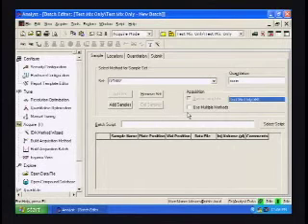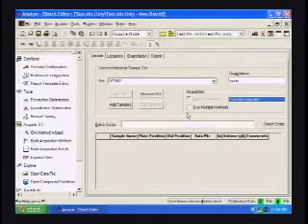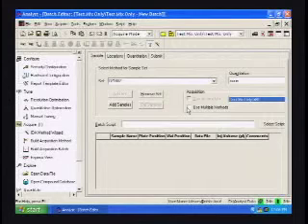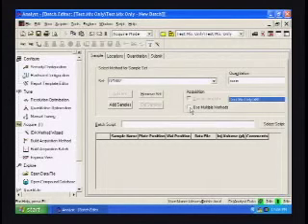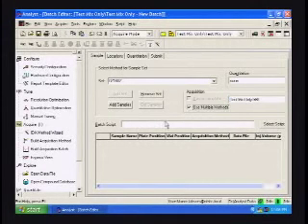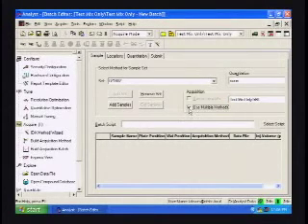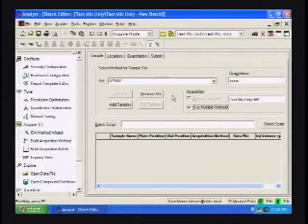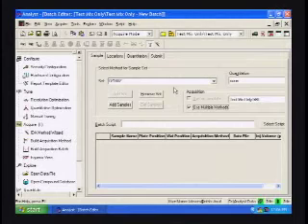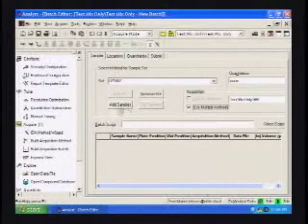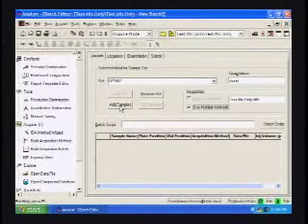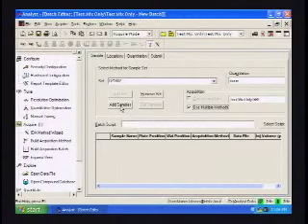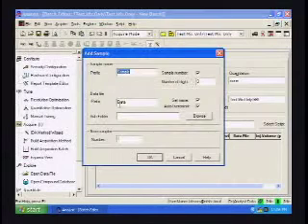At this point, if we wish to set up a batch acquisition using multiple methods, we would click on this box. And even though we don't want to, I'm going to click on that box anyway, just to demonstrate the capability of the instrument. So now to this particular set, we want to add samples. So we're going to click on add samples.